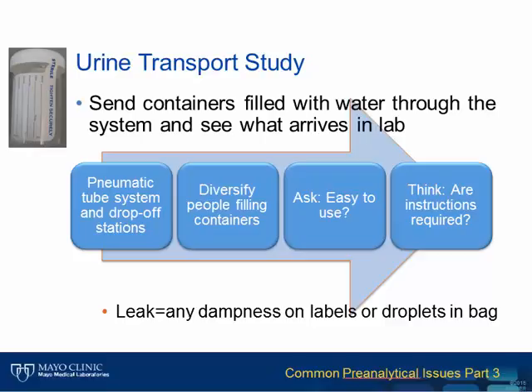We asked the volunteers what they thought of the container, as we needed to assess whether additional or specialized instructions would be needed when containers were handed out. Upon receipt in the lab, all evidence of leaking was documented.